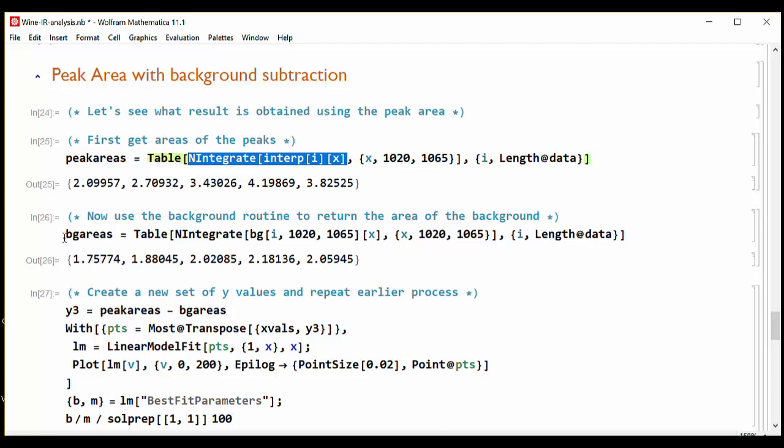And we get areas for each one of the peaks for each one of the concentrations. Likewise, we need to subtract out the background, and we will do so by using the background function, which was just creating the two points line, assuming that the background is linear. And we get a set of background values, background areas.